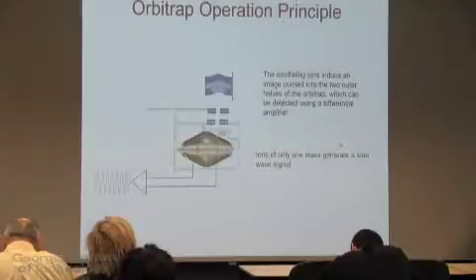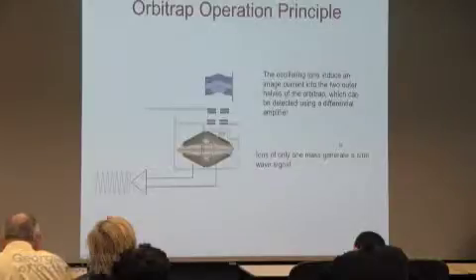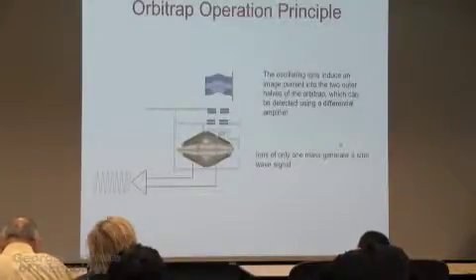In this case, where you have only one kind of molecule, you get a sine wave. But if you have a mixture, you get a mixture of sine waves that you deconvolute using a fast Fourier transform. This whole thing happens behind the scenes, so you don't have to do this manually.